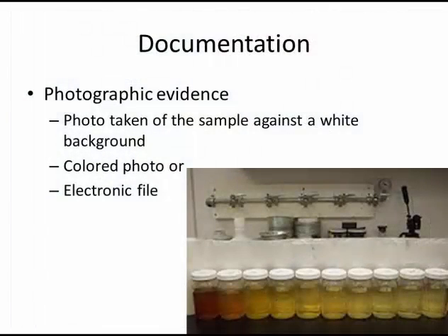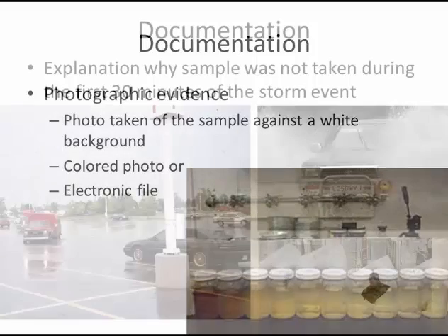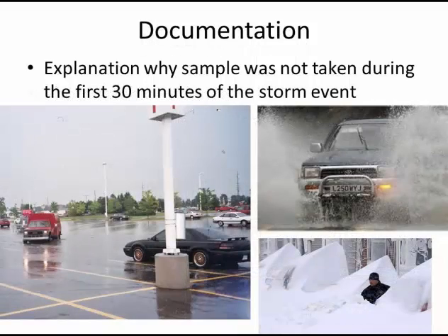After the sample is visually assessed by the certified operator, a colored photo of the sample against a white background must be taken. The photo or other visual recordings must be saved for documentation. If the sample was not able to be collected during the first 30 minutes of discharge, a written explanation needs to be included in the documentation.